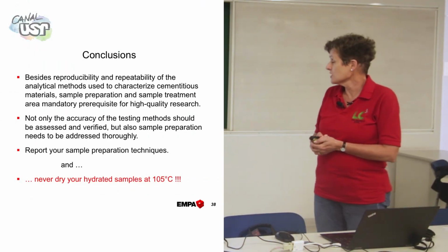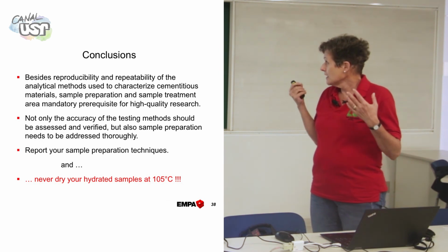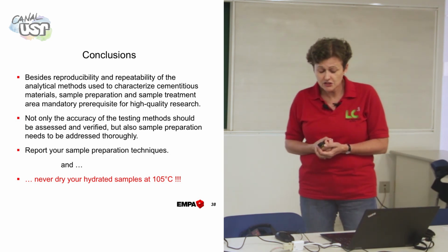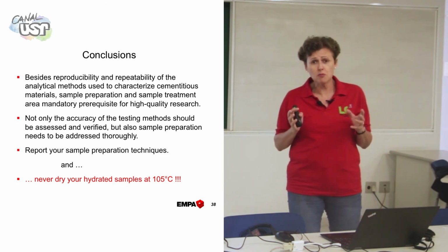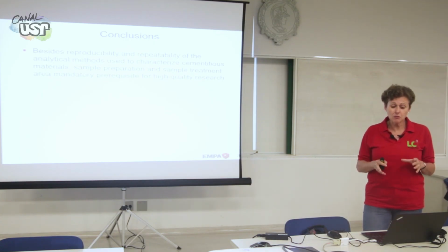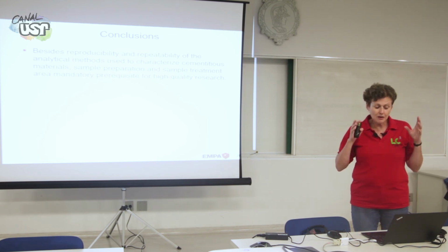So this is the conclusion of this first part, that the first prerequisite really is this sample preparation. There's very little you can do if you prepared your sample badly in the first place. And I'll talk a lot more about this in the SEM part, because there you cannot rescue a sample that's been badly polished, for example, or badly prepared. And please, invest the time in preparing your samples well, storing your cement well. It will save you masses of time afterwards.